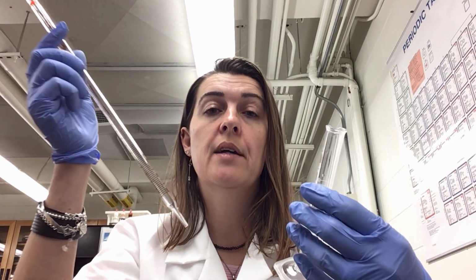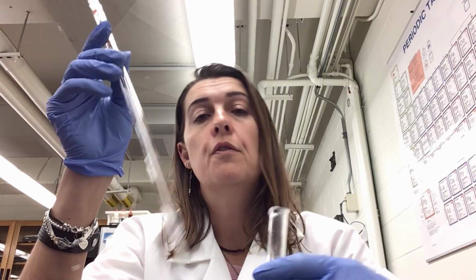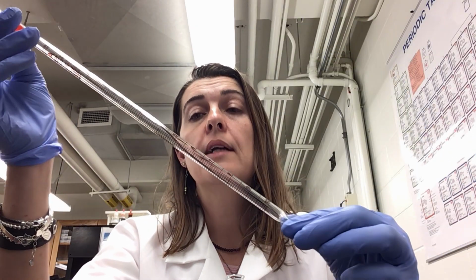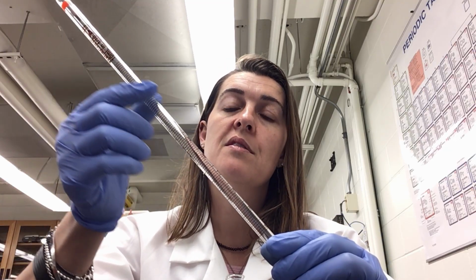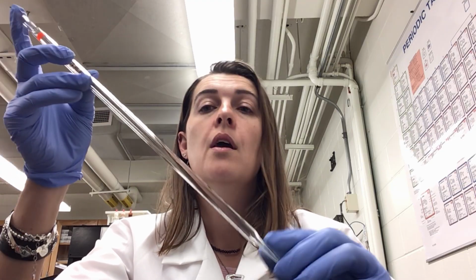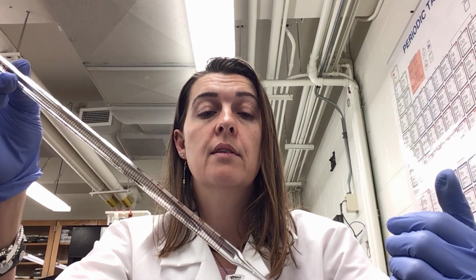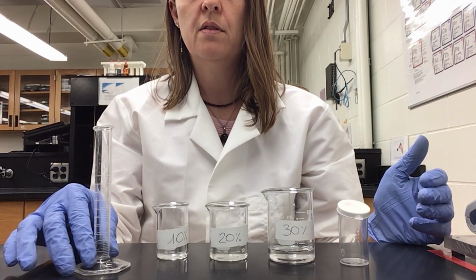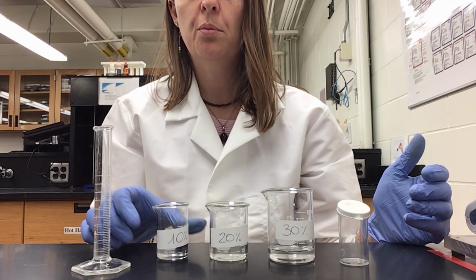However, sugar solutions are dense and sticky. The more dense they are, the stickier they are. Therefore, if you had to use the pipette, especially at higher percentages, for example, the 30%, the result will be that much of your solution will be stuck on the inside of your pipette, and you will not deliver the entire 10 milliliters, which would impair your measurements and your investigation on the density of the sugar solutions. So, although this is the most accurate and precise, for practical reasons, we need to use these to measure the 10 ml.